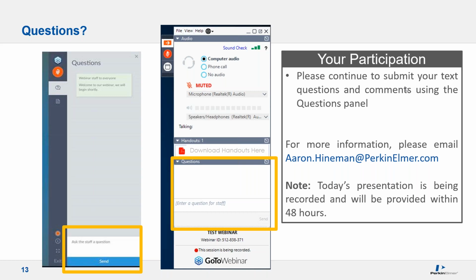Yeah, exactly. So that's where I find MSF really shines, when it's a non-direct overlap and a very structured background, i.e. there are multiple interfering peaks nearby that can affect background correction, or it could be hard to do inter-element corrections properly. That's where MSF really does a good job in those structured background scenarios.